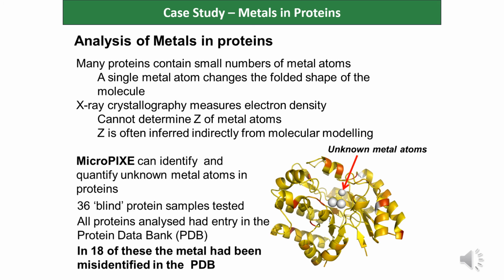In a recent paper, 36 blind protein samples were tested. All the proteins analysed had an entry in the Protein Data Bank. In 18 of these, the metal had been misidentified, throwing some doubt on the accuracy of the Protein Data Bank with respect to metalloproteins.